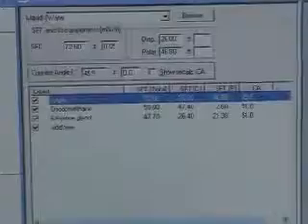Water, diiodomethane, ethylene glycol. They have been taken over in this window. And the surface energy has been calculated here to be quite high, about 50 millinewtons per meter. And here we see the typical Owens and Wendt diagram for this measurement.